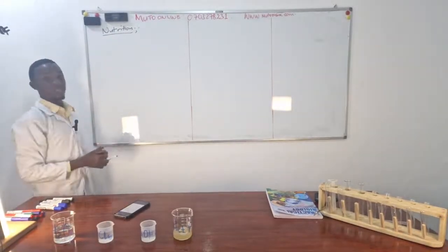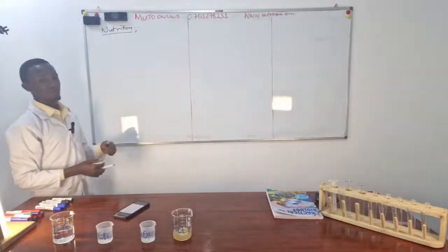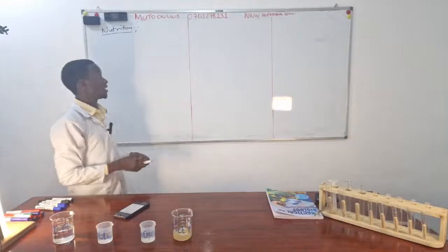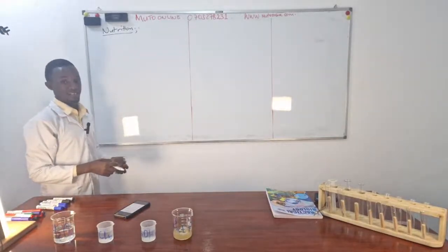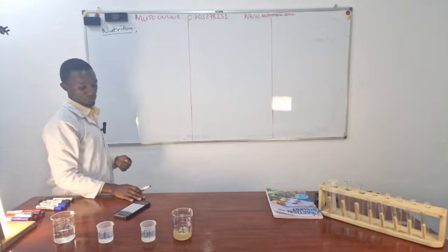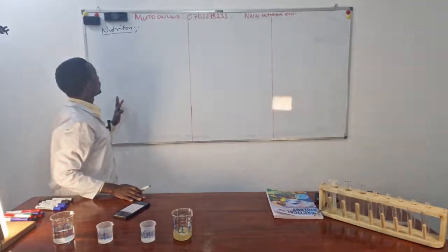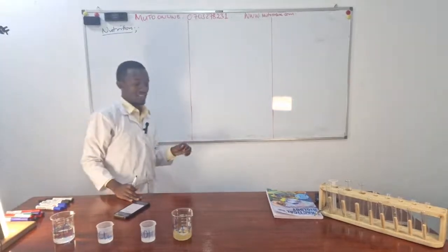and specifically the activities of enzymes. We are going to investigate some of the properties of enzymes that actually affect the activities of these active substances, the enzymes in general. These practicals, like we always say, they are simple.